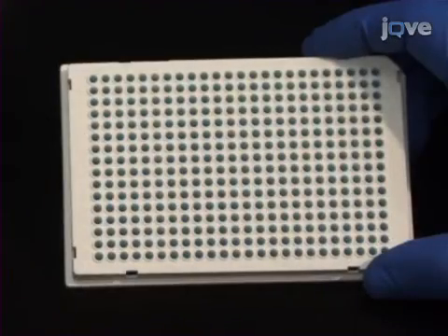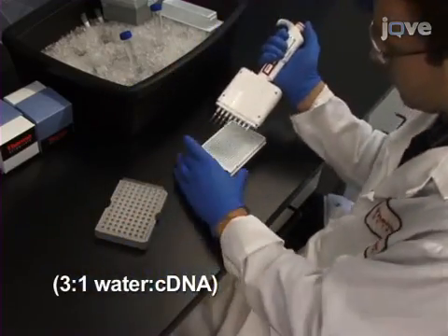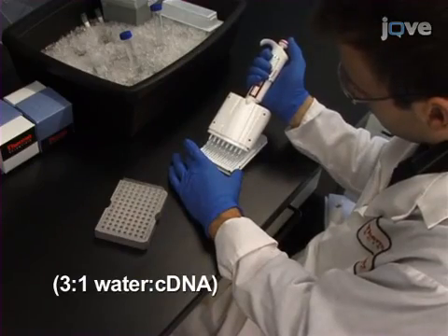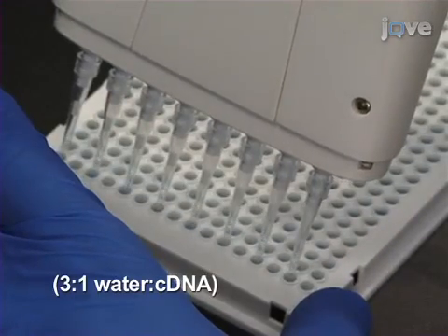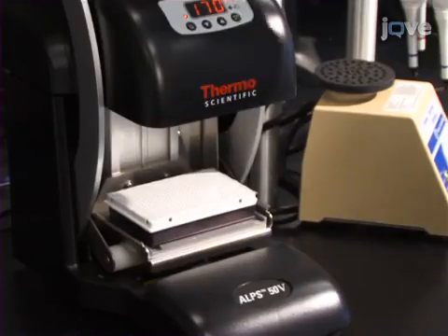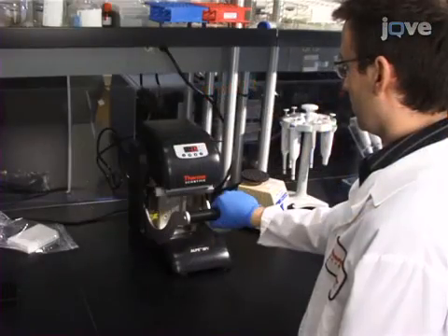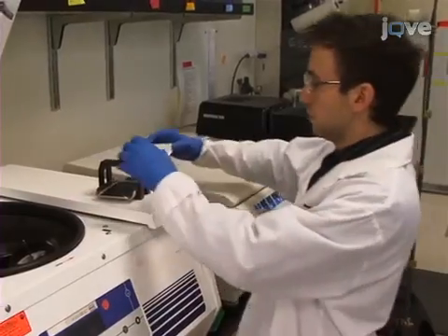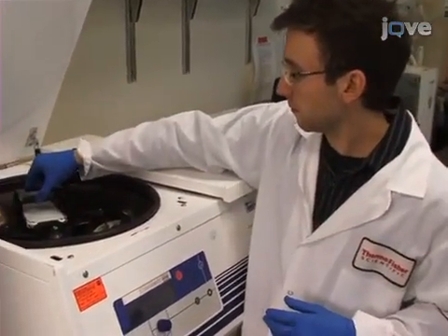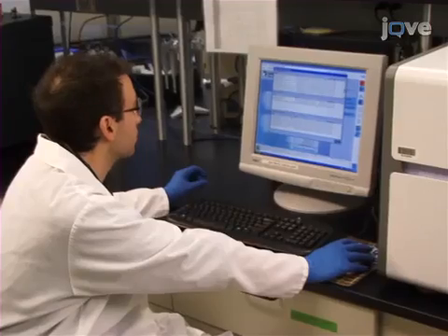Multiple cDNA libraries and reference genes can be assayed on the same plate since all cycling conditions are identical. Once the 1x master mix has been added to the appropriate wells, add diluted cDNA template to each well so that the final volume is 10 microliters. Pipet up and down to mix. Seal the plate with either an adhesive seal or a heat seal. Place the plate in a centrifuge and spin down to bring the reagents to the bottom of the well and remove any bubbles, which will interfere with fluorescence readings.